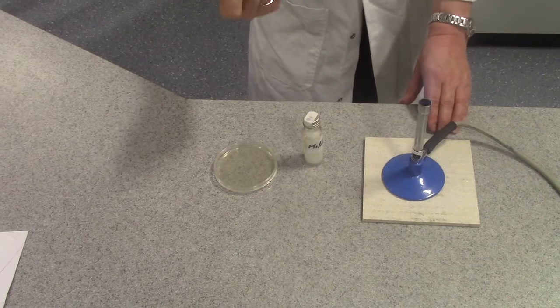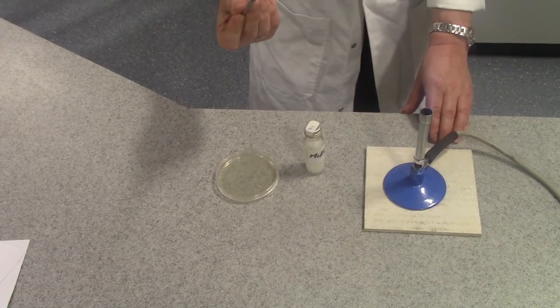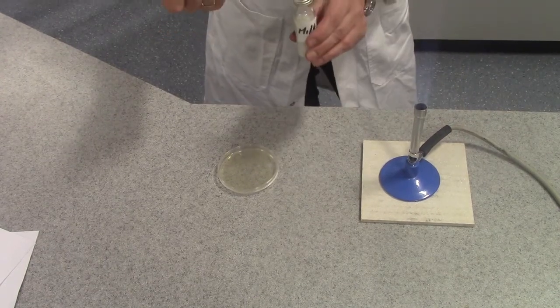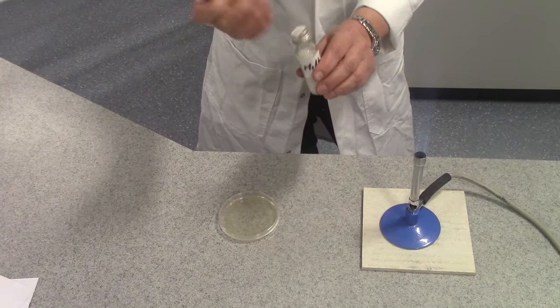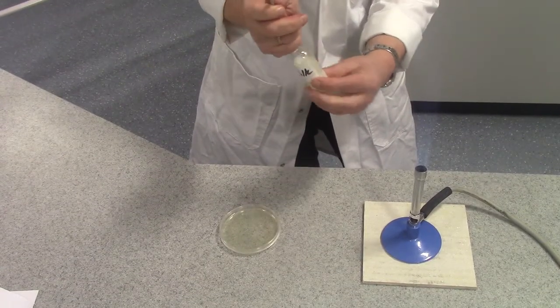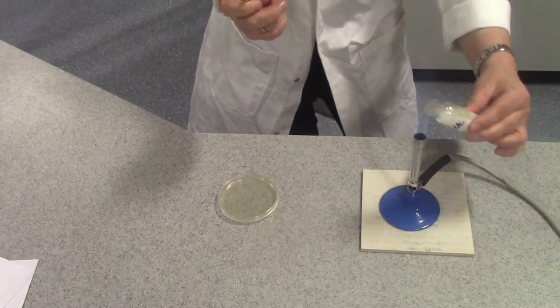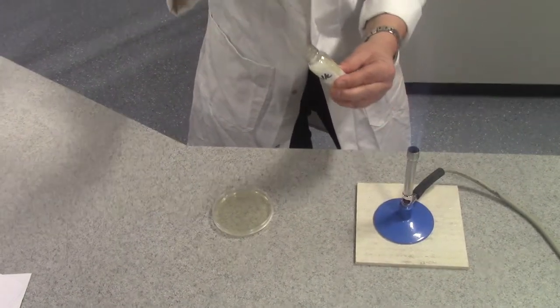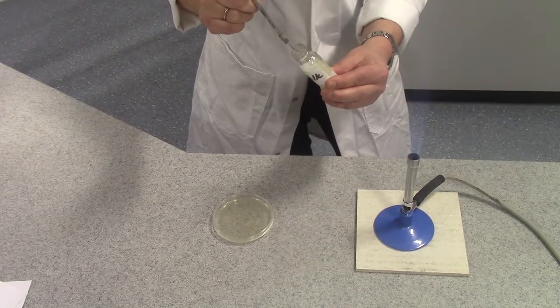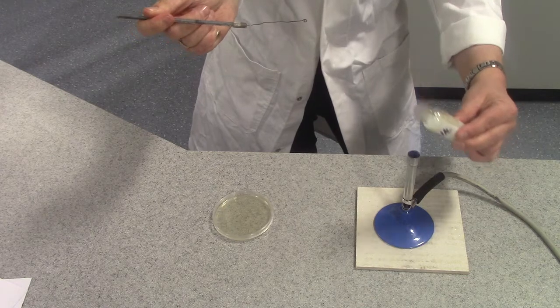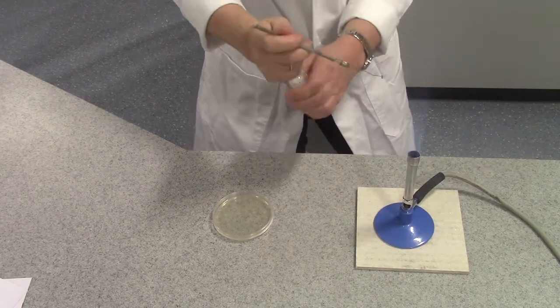Allow the wire loop to cool for a few seconds, and then we're going to take the sample of milk, carefully remove the lid, and pass the top of the glass bottle through the flame. We're then going to insert the loop just to take out a small sample of the milk, re-flame the top, and then put our lid back on.